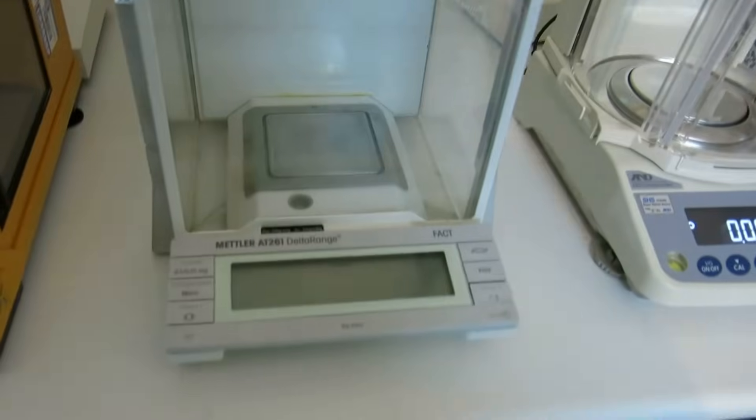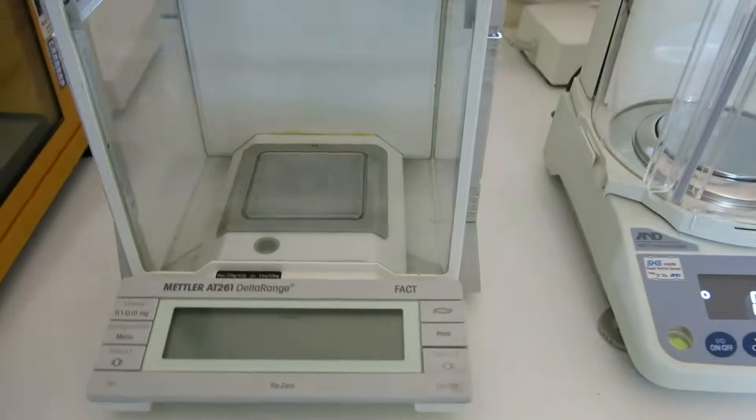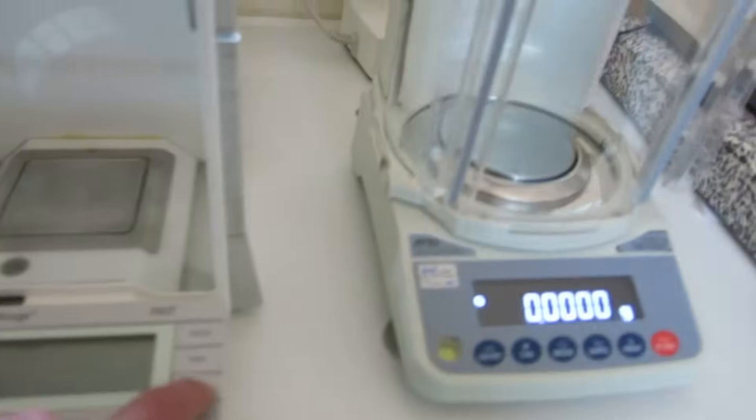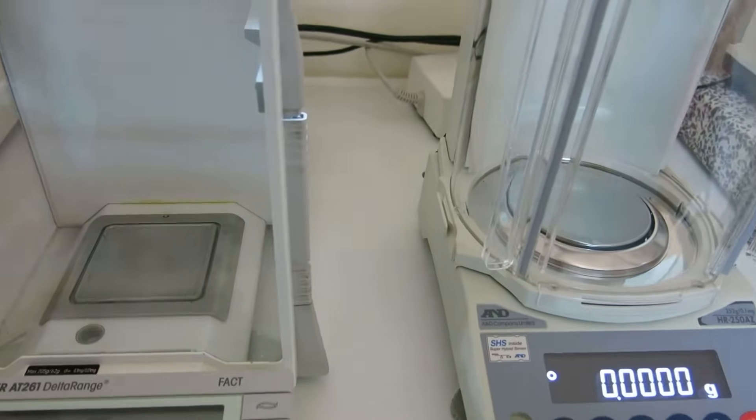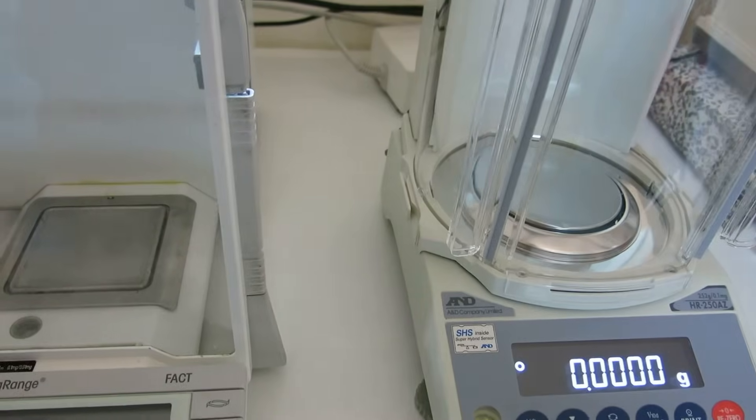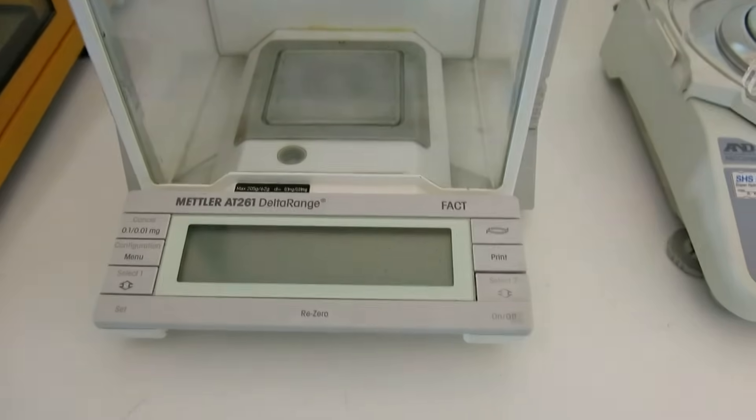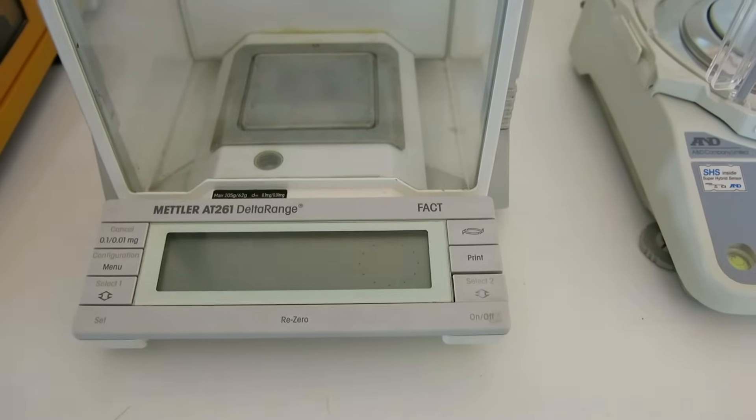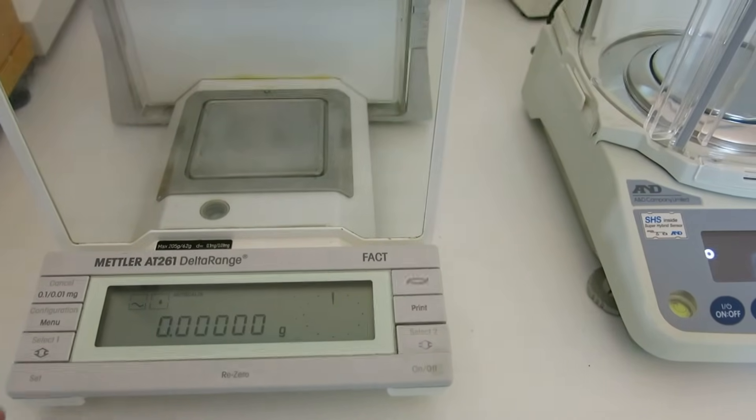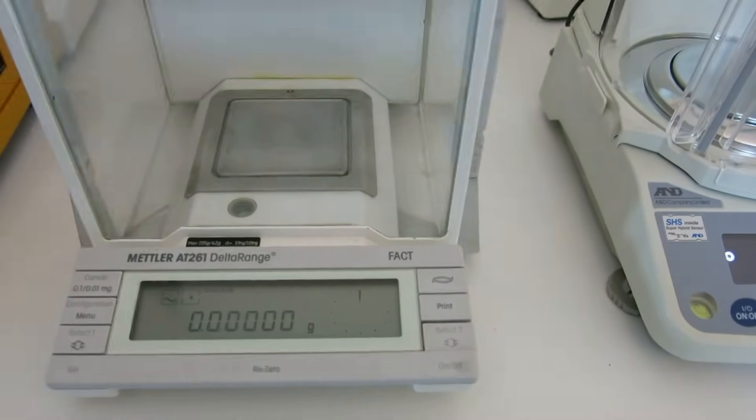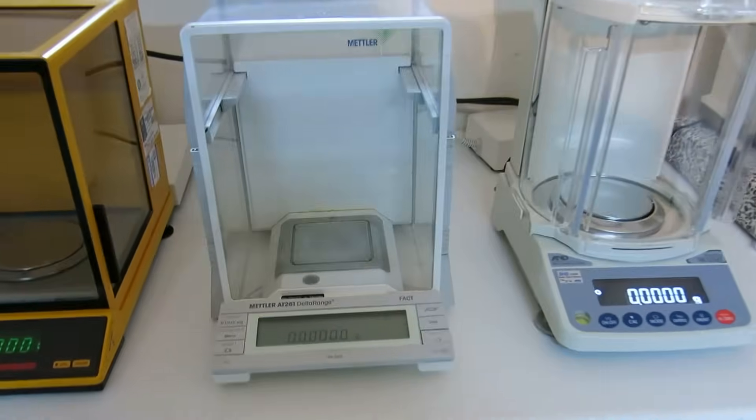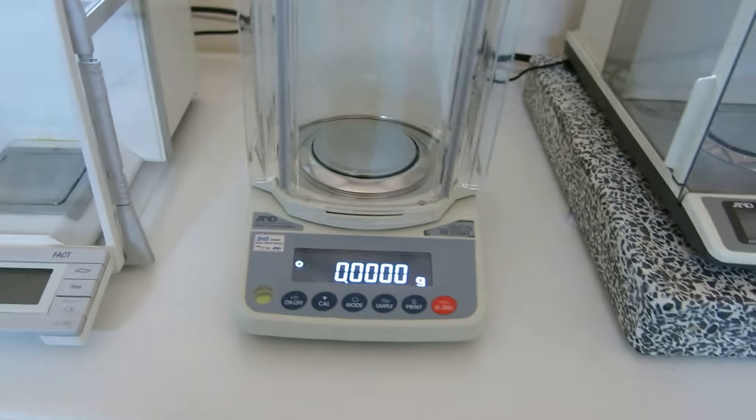We then move on to the Mettler AT261, which is a 5 decimal place balance. Let's switch it on. Let's put the power on here. It goes through its self-test. There we go. You can see the action there working pretty well. So that's a 5dp.